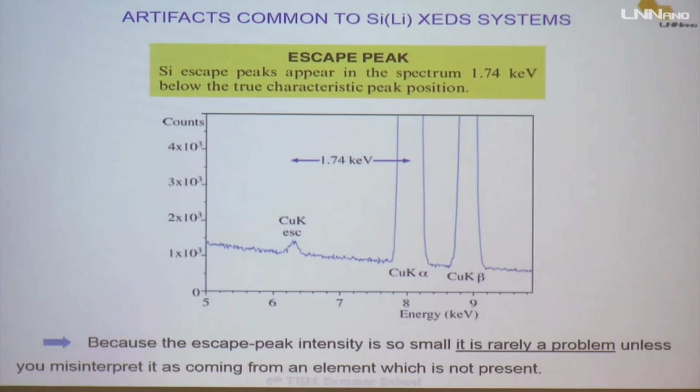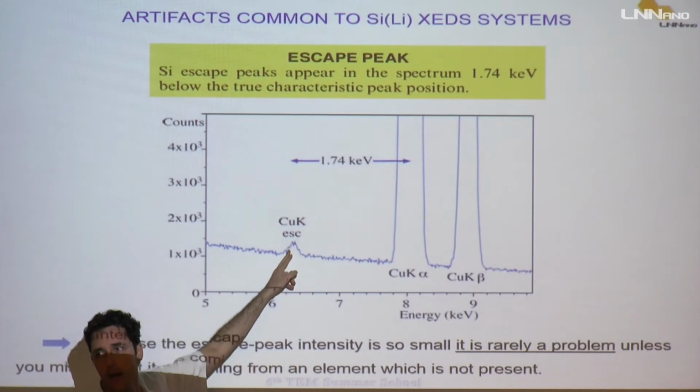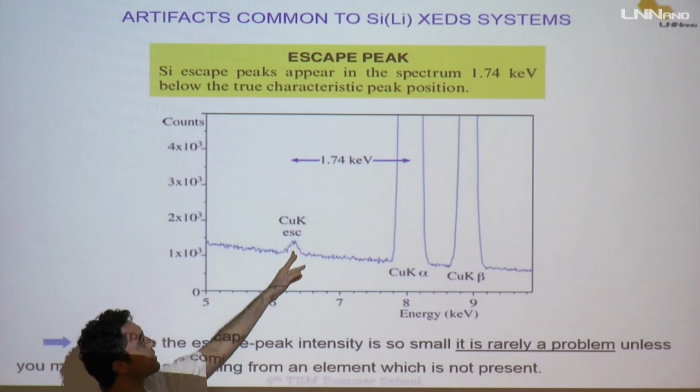And then it will lose the amount of energy of the silicon. And then you start to have what we call an escape peak.